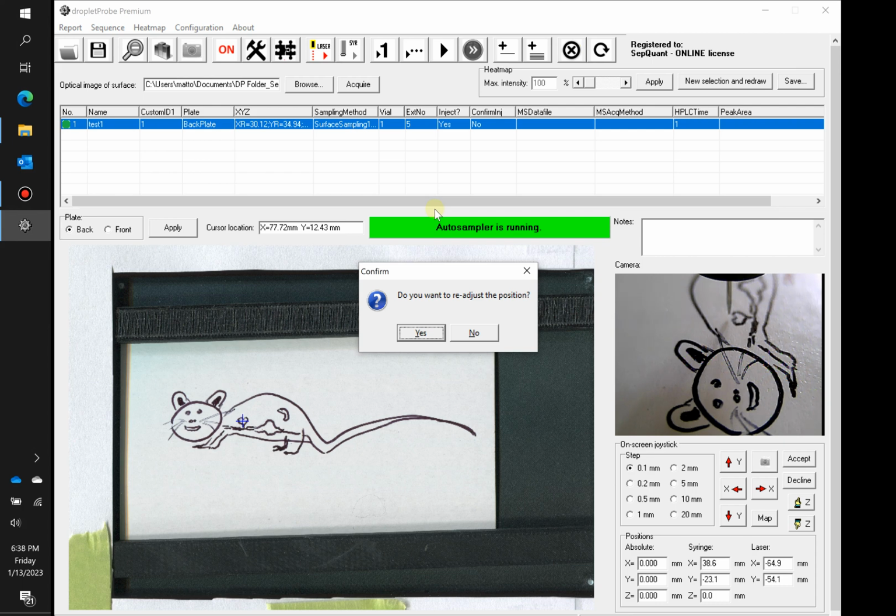The other part is you really want to get a nice quality assurance of, is my droplet actually going on tissue? So this is where you get an idea of where this is. I can see my position's not exactly where I chose on my screen. If I reference here to here, it's a little bit off. That's probably due to the bad calibration that I need to do a little bit better on. But at least this gives us an option that we can adjust this.